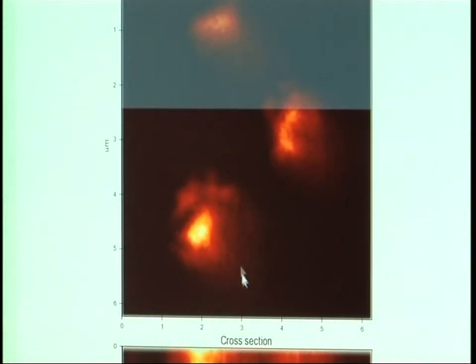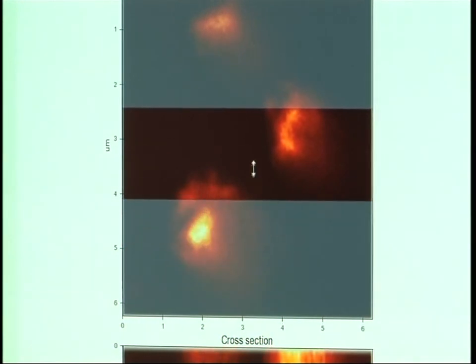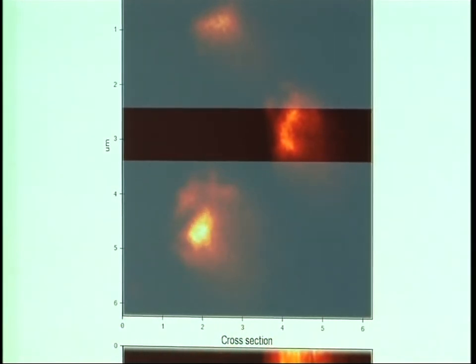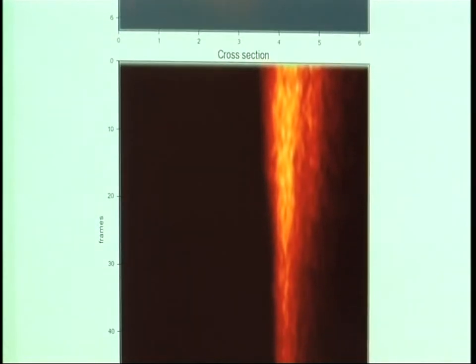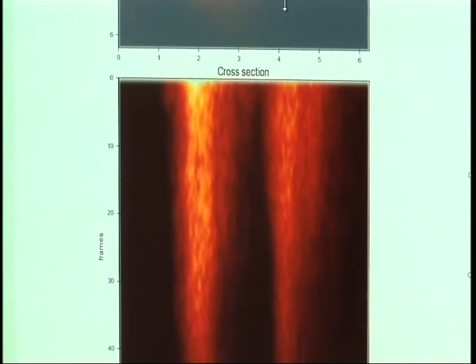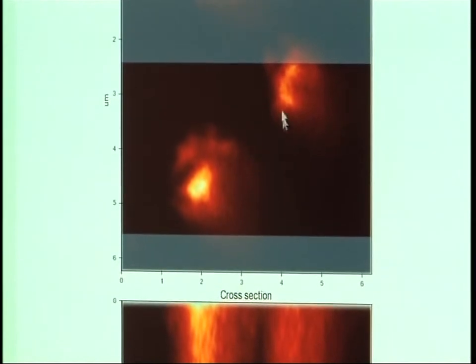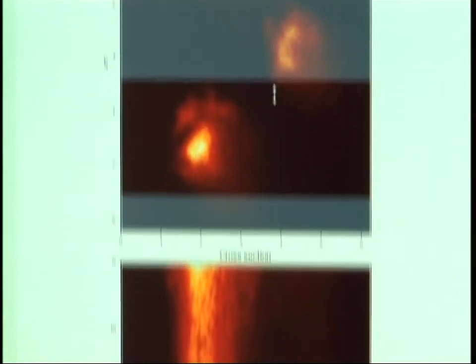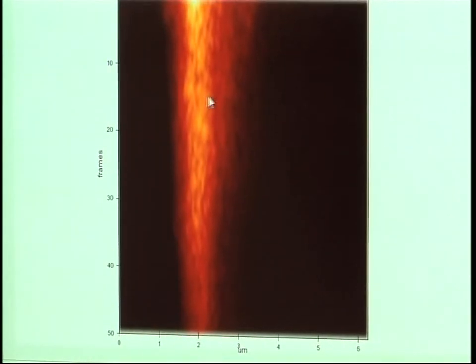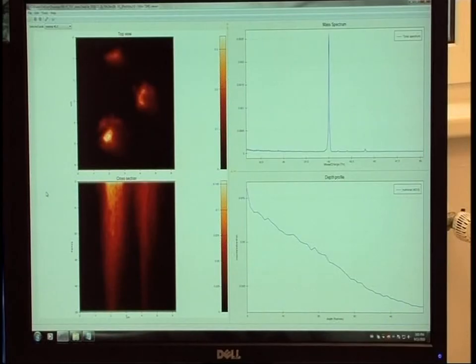And here we can see three areas on the sample where calcium occurred. We can look at one particular part, and we can see that this part has this type of depth profile, while another part here has that kind of depth profile. The user can thus identify 3D information about the precise mass distribution of the given element in the given nano object.